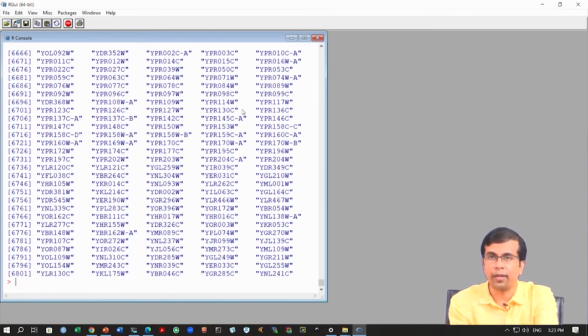Okay, so I think this part is clear. If you do not have your own data, I will show you in the next class where we can download this data, and we can try these different things on it. If you have your own data, definitely try to load it, and then you can start working on it. In the next class, we will do a bit more on this data set. Since we have loaded it now, we can do a lot of things, and I will also show you how to start loading the packages that will be required for our analysis.